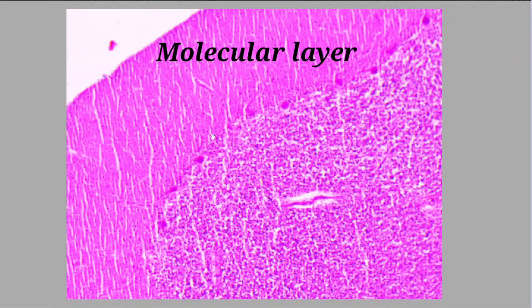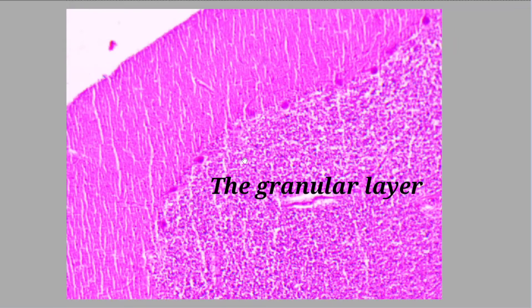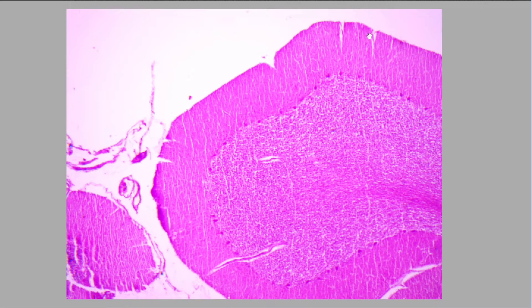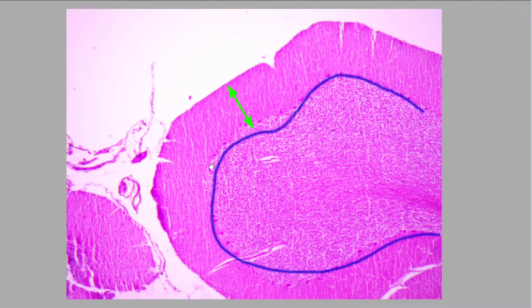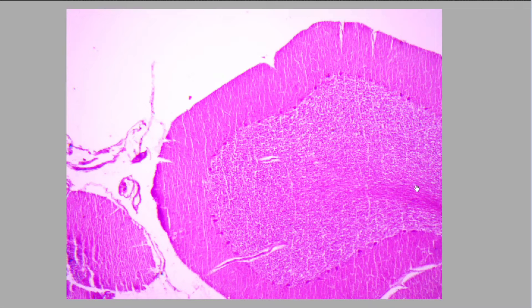There are three layers in the cerebellum. The middle layer is the Purkinje cell layer. The layer which is outside the Purkinje cell layer is known as the molecular layer, and the layer which is deep to the Purkinje cell layer is the granular cell layer. In the center, there are fibers which form the white matter of the cerebellum.